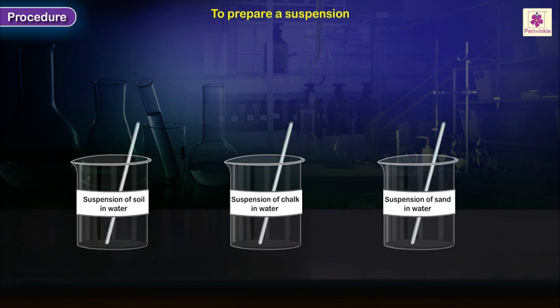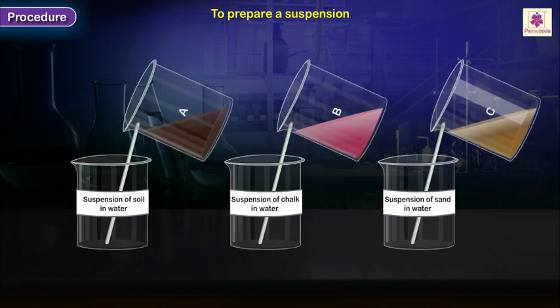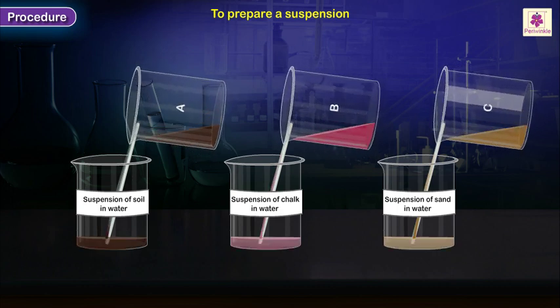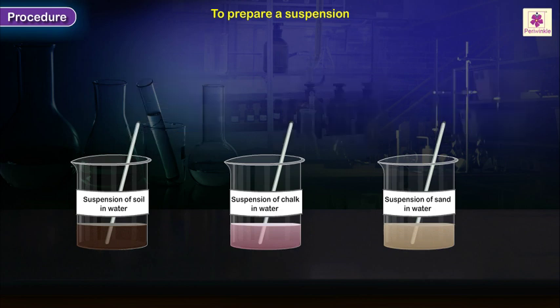Using clean glass rods, decant the supernatant liquid of all three solutions into the labeled beakers and observe.